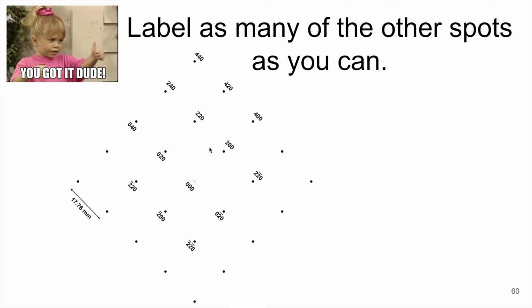All right, so the next thing we can look at is that effectively this direction is the x direction, because we're talking about 200 and 400. And we can also look at what a peak over here would be.